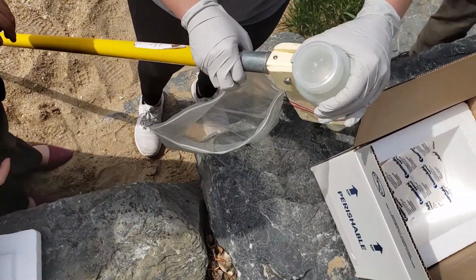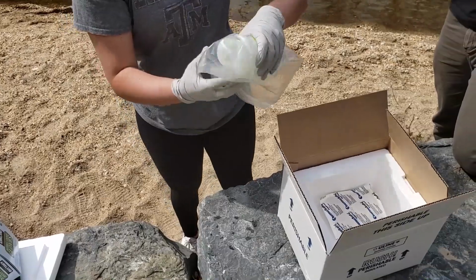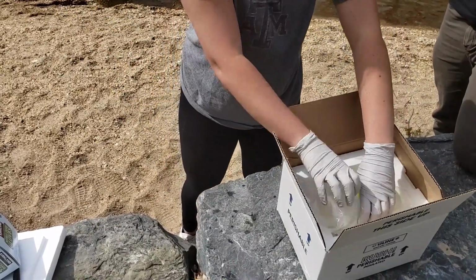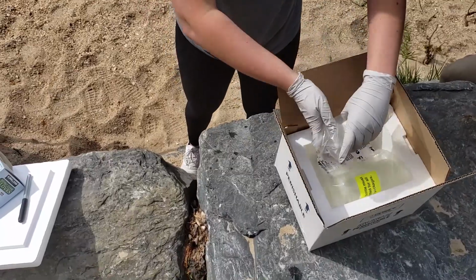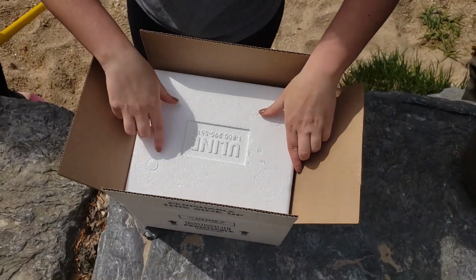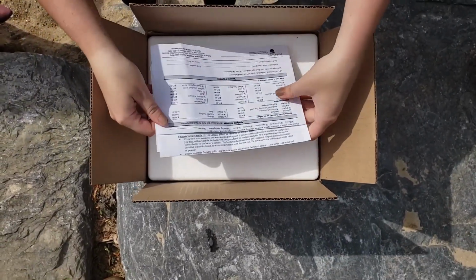Place sample bottles in a plastic bag for extra protection against leaking. Immediately store samples on ice. Collect all other necessary samples in the same manner. Close the cooler. Place filled out forms and payment on top.